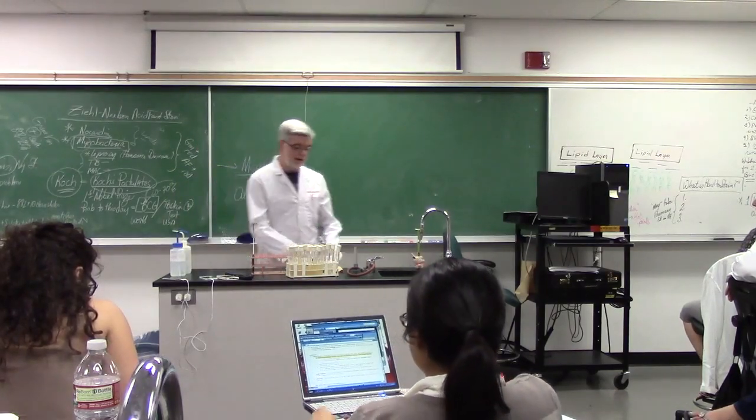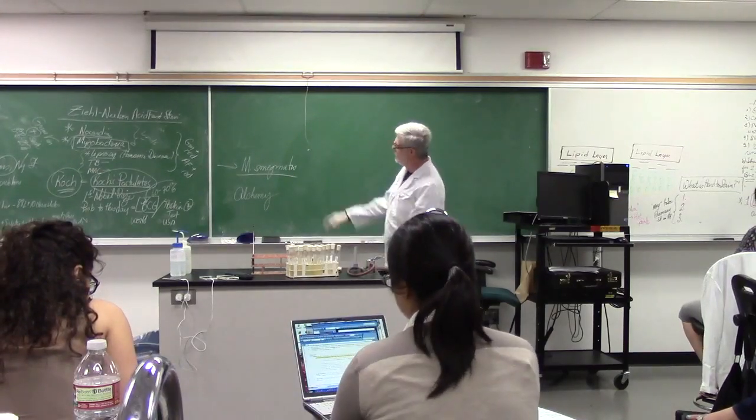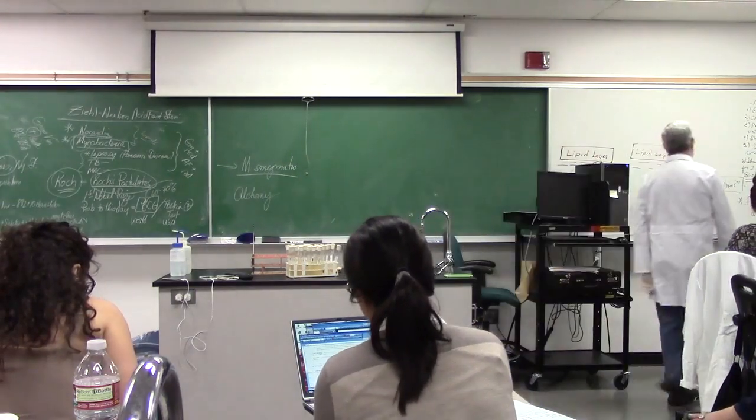Just FYI. All right, so that's the history, a little bit about Koch's postulate. Now we're going to talk about the theory and the stain, how it works and why.